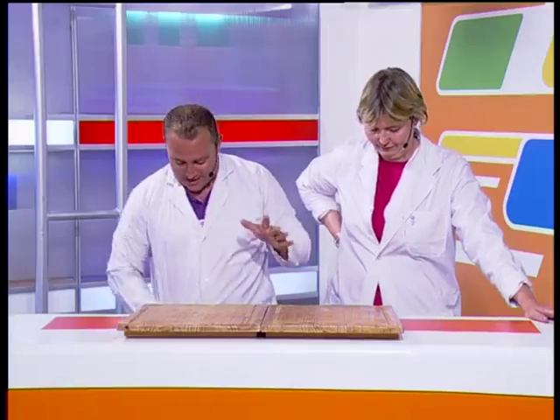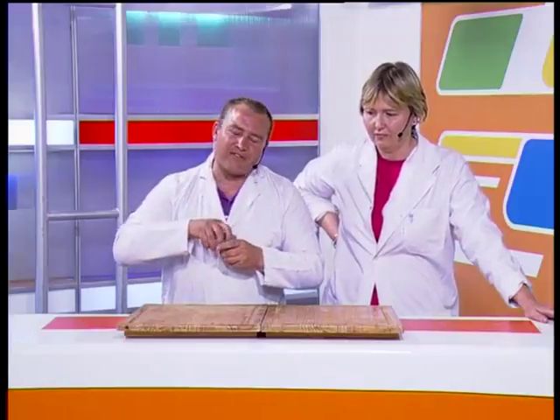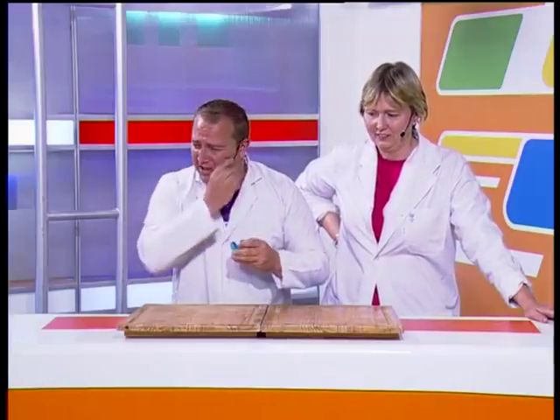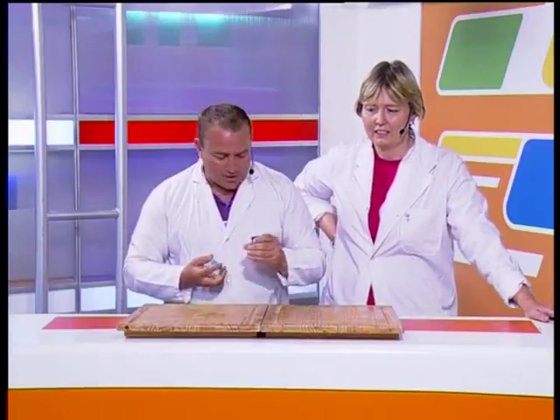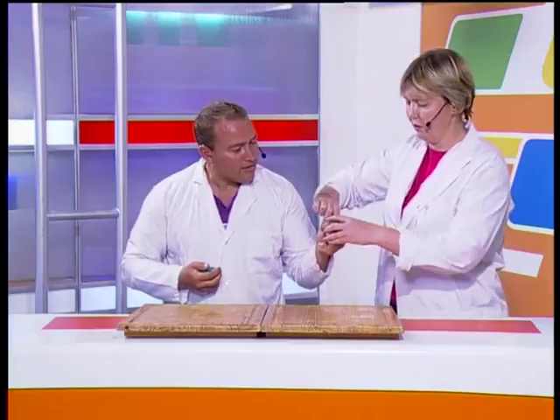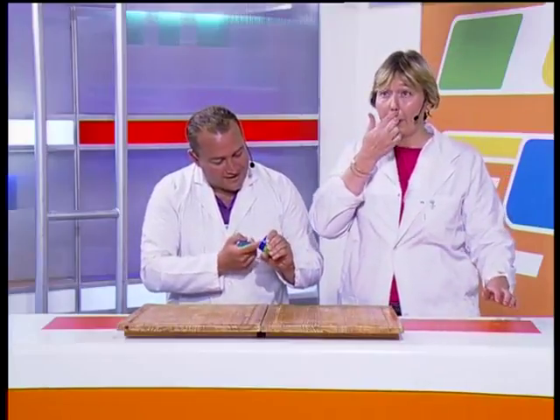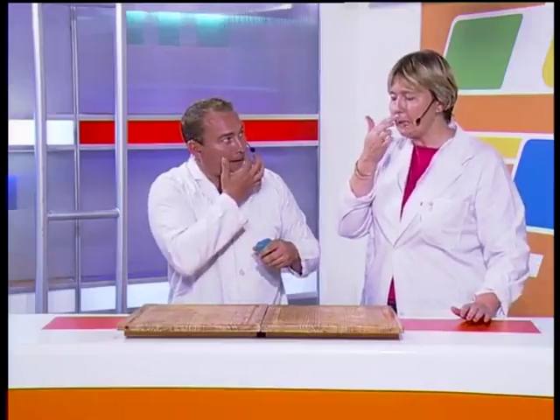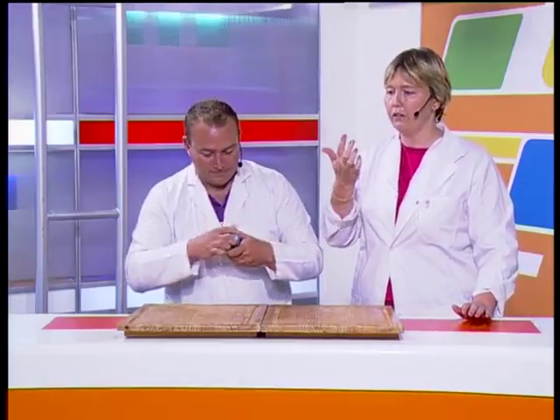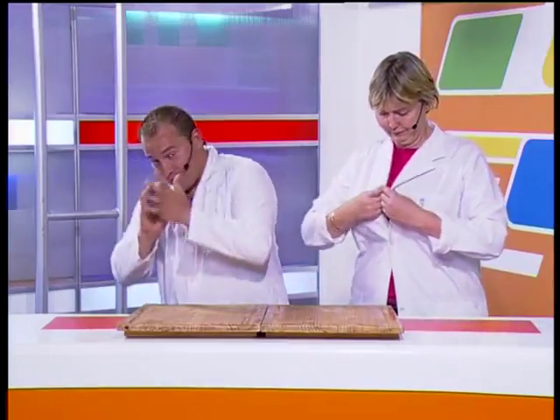Well, okay. First thing we need, right? We normally use Vicks because this stuff smells beautiful. And if you know what I mean by beautiful, it's not very nice. Right, so, what are we going to do with it? Stick it under your nose, because that's all you're going to smell, instead of this lovely smell of the juices, should I say. Okay, we'll have very clean sinuses after this. Now that's what a lab coat's for. Exactly. Right, so we've got that.